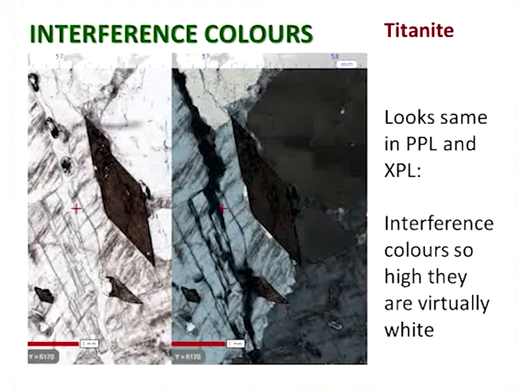Okay, so another thing about interference colours, and this is something you see with calcite, but with some minerals they have very strong colour, and I talked about biotite: the colour of biotite masks the interference colour. And here's another mineral where that's true as well. But luckily titanite has such high interference colours, very similar to calcite, that they don't really interfere with its strong plain polarised light colour.